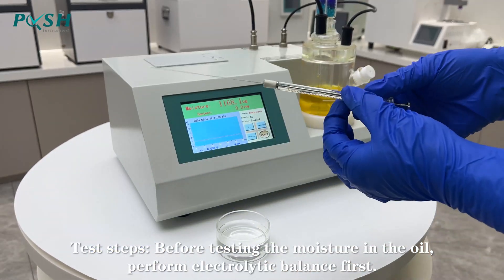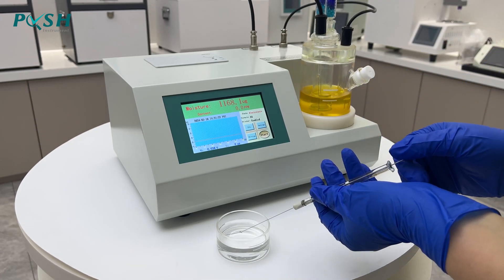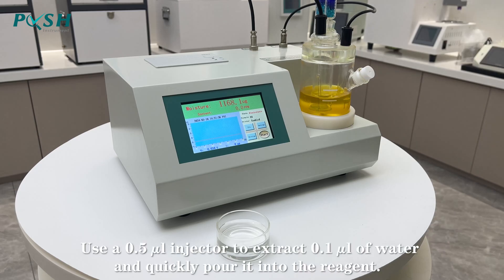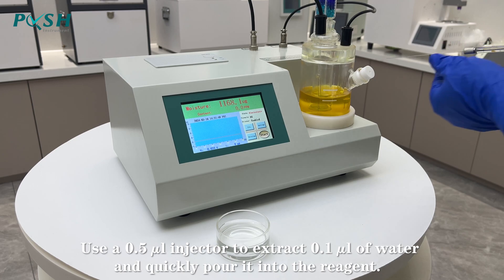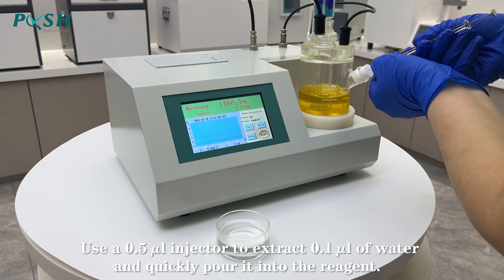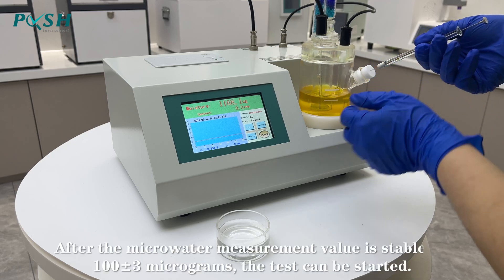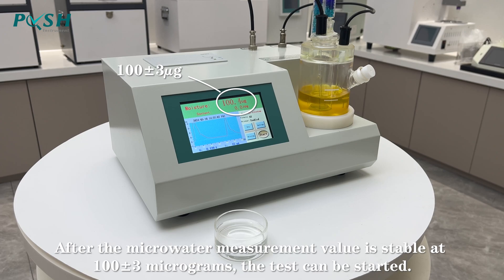Test steps before testing the moisture in the oil: perform electrolytic balance first. Use the 0.5 µL injector to extract 0.1 µL of water and quickly pour it into the reagent. After the microwater measurement value is stable at 100±3 µg, the test can be started.